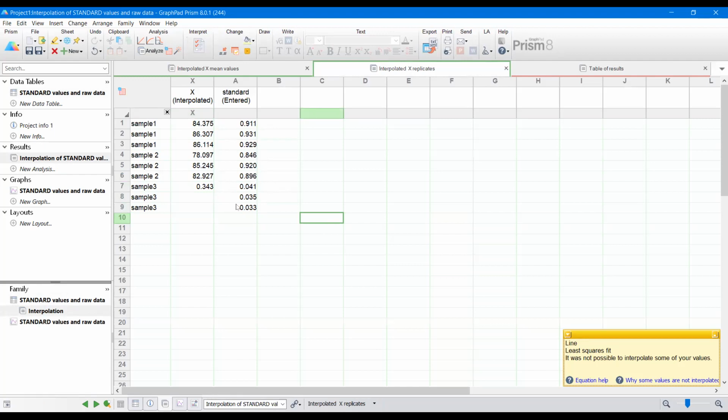But if somebody is asking you to perform with this application, you need to follow this lead. And in that sense, you need to say that that was not proper. In that case, what you can do is just manually change the dilution ratio and measure another set, so extend the standard measurements or whatever. So what you have now is three values, sample 1, sample 3, and sample 2, and you just need to represent these.